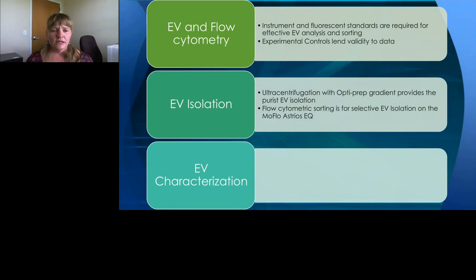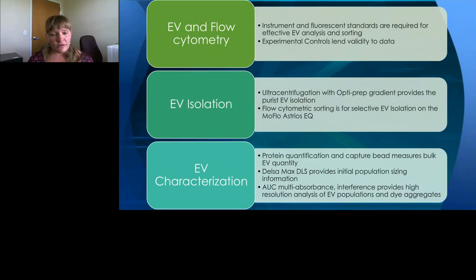And finally, characterizing by doing protein quantification and captured beads measures bulk EV quantity. DelsaMax DLS provides initial population sizing information and quick analysis, and the AUC provides multi-absorbance interference, and it provides high-resolution analysis of the EV populations and dye aggregates.